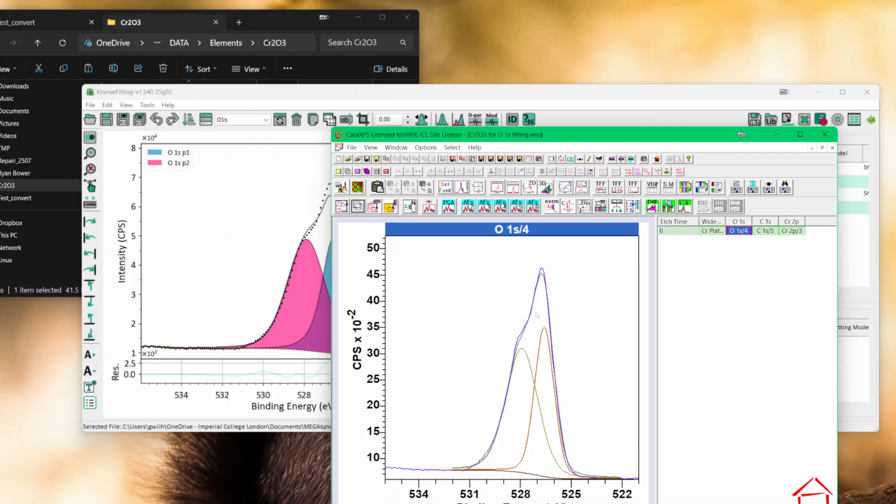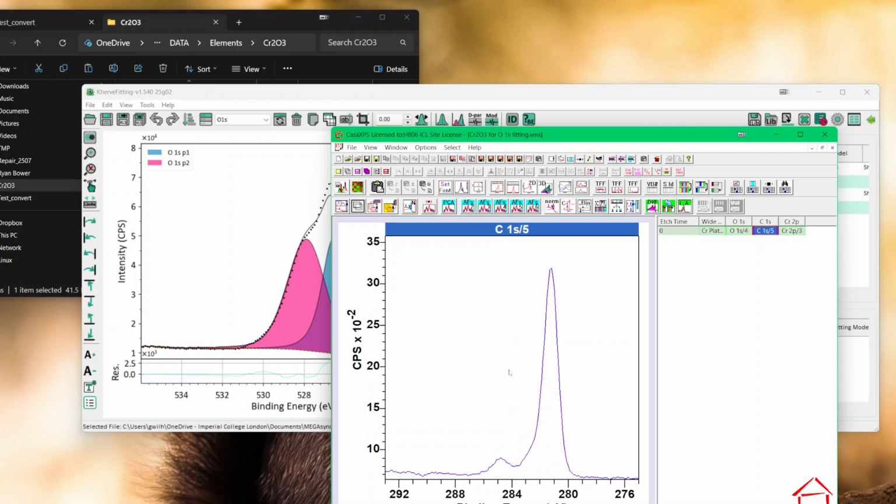And the next bit is, for example, now if we go to Carbon 1S, you have this data. And the data, just to show you how properly to import it. So let's say it starts around there, 752. You see the 752 shown here. This is the start of the data, 757.